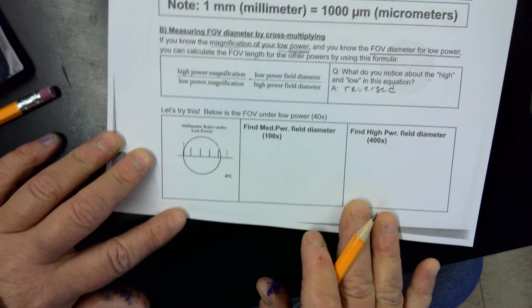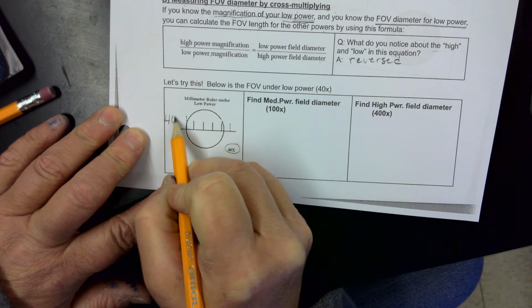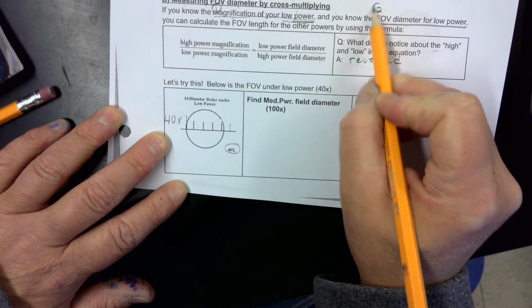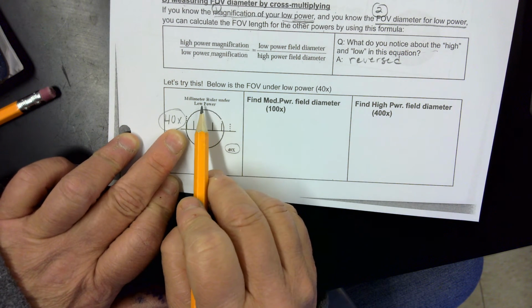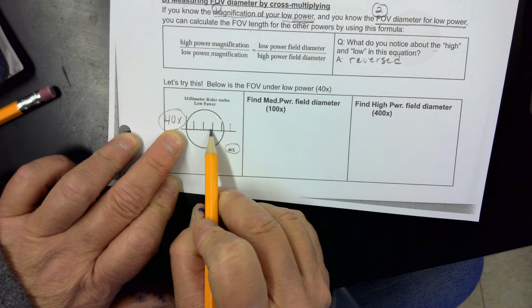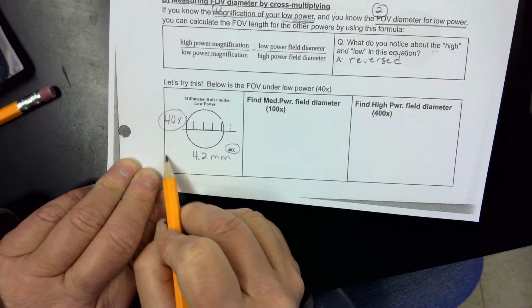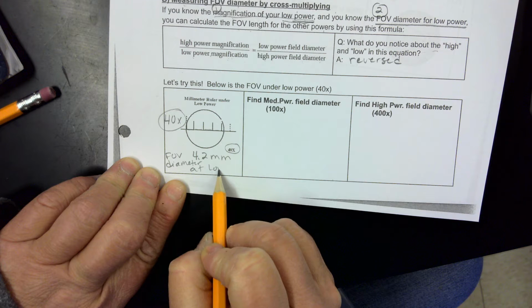So let's try an example. What we have here is 40x. This is a 40x magnification. That's one of the things we need to know, right? We need to know the magnification of your low power, and we need to know the field of view diameter for your low power. So there is our magnification. Here's a millimeter ruler, and under low power, I see 1, 2, 3, 4. I'm going to call this about 4.2 millimeters. So there is our field of view diameter at low power.